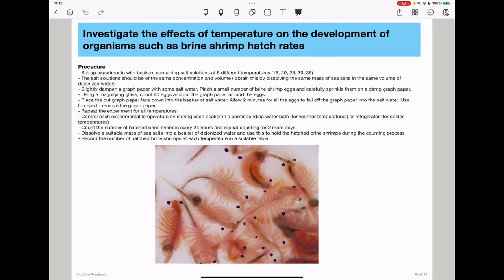We begin with the investigation using brine shrimp. Because the independent variable is temperature, we set up experiments with beakers containing salt solutions at five different temperatures. Since temperature is being varied, everything else has to remain the same, so the salt solutions have to be of the same concentration and the same volume, obtained by dissolving the same mass of salt in a specific volume of deionized water.